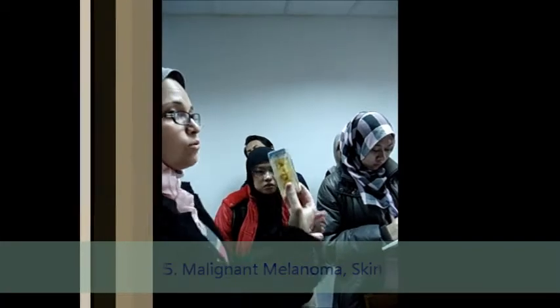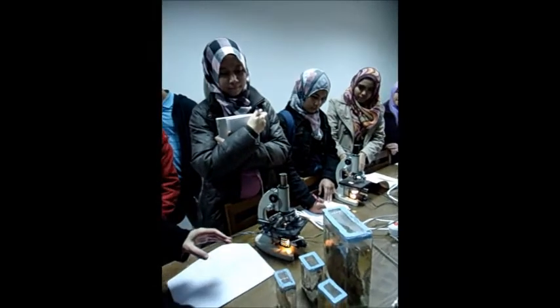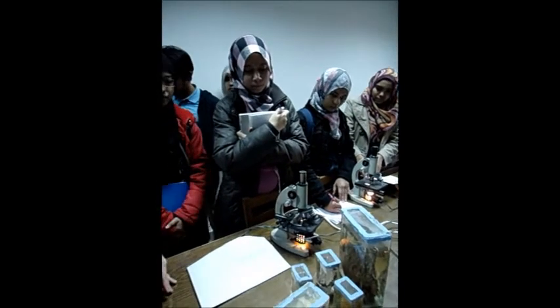In the exam, you will only be asked to diagnose, just to identify. Whether it's light or a jar, all that we will ask you for is to diagnose. Okay? So I will bring you a specimen like this, and you say what's the diagnosis. You say lipoma subcutaneous tissue. If I bring you this specimen, you will say it's a basal cell carcinoma of the skin. Okay? Etc. etc. Right.